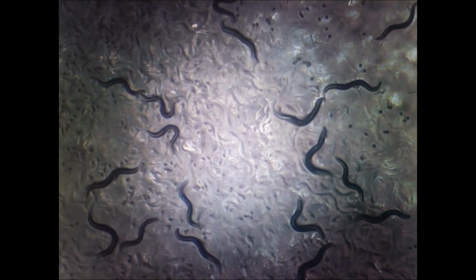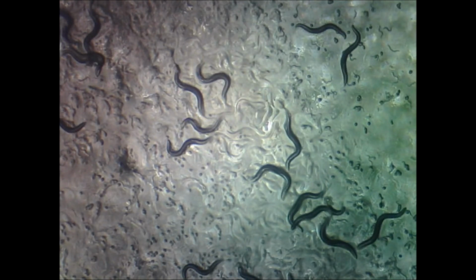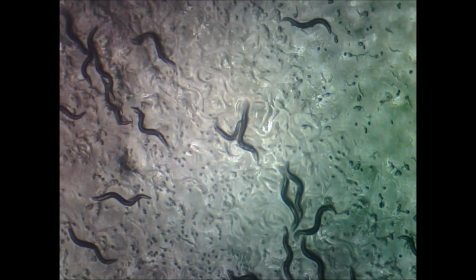Here is a sample of UBC7 worms. As you can see, they are visibly more active than the GFP worms. And here is a sample of UBC6 worms. Their speed seems almost the same as the GFP worms.